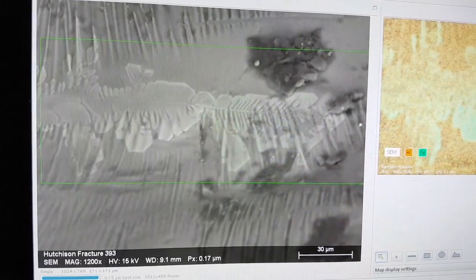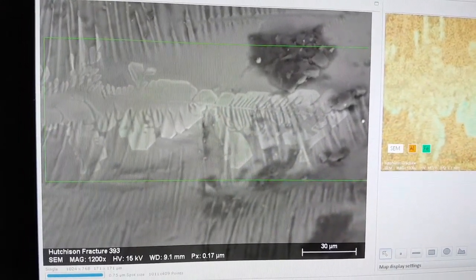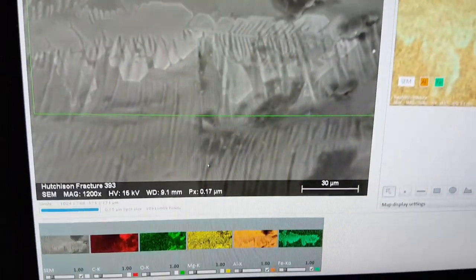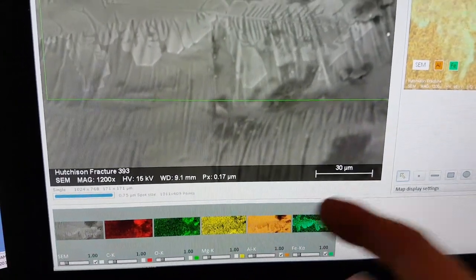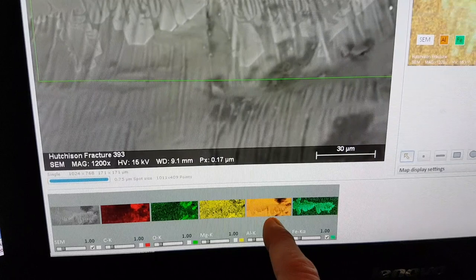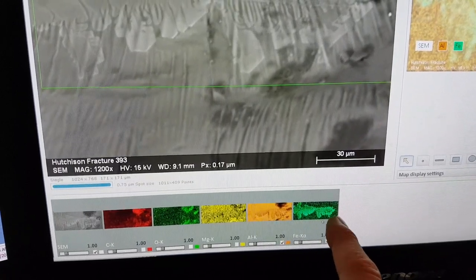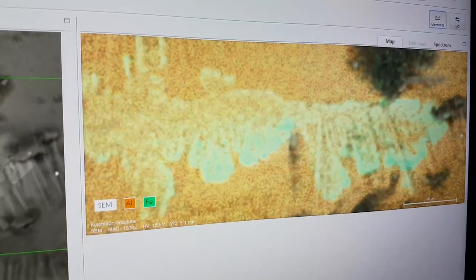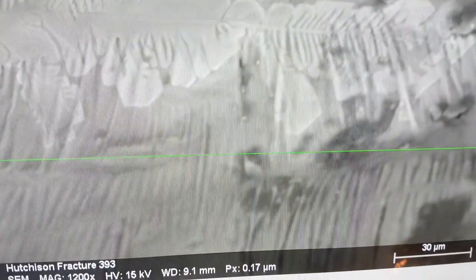Well, this is also interesting on the Hutcheson fracture sample. The bulk of this is aluminum. And you can see this is aluminum. But the aluminum seems to have gone away a bit. And there appears to be iron. And it's in this kind of crystal structure that's grown over the surface.